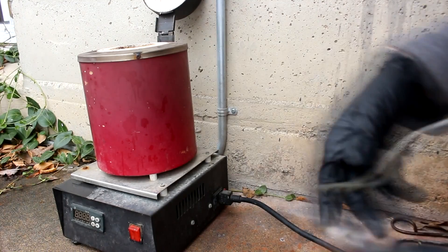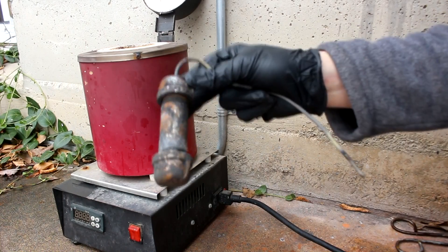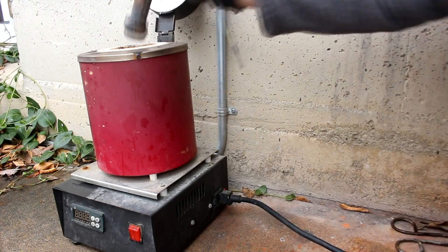Hi everyone, welcome back to my lab. So in today's video I'm going to be producing cesium metal in a way that is very similar to how I produce the sodium metal. But there are two main differences.